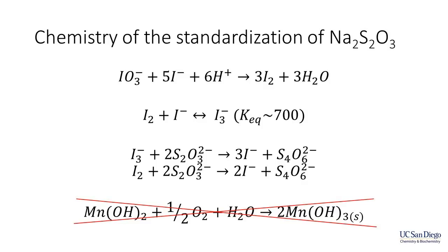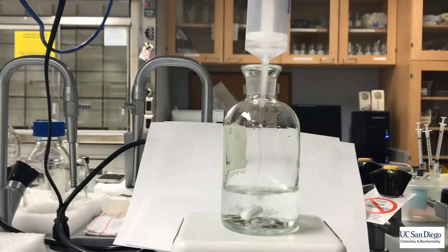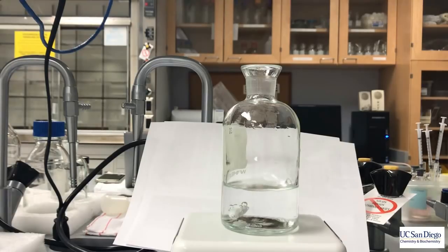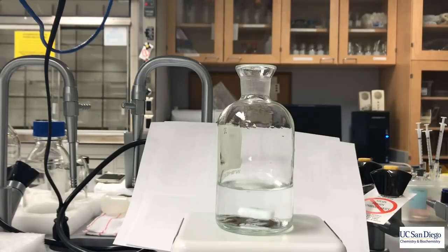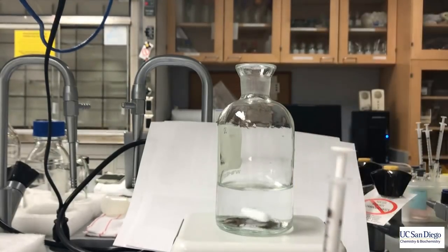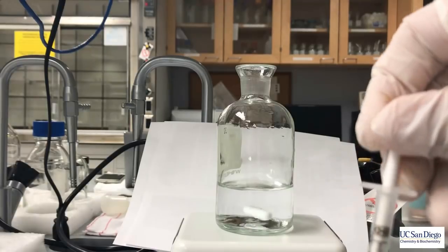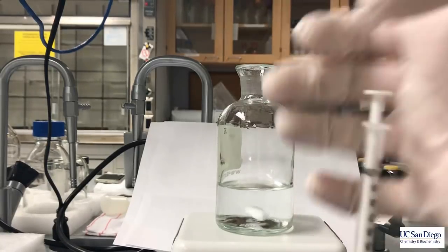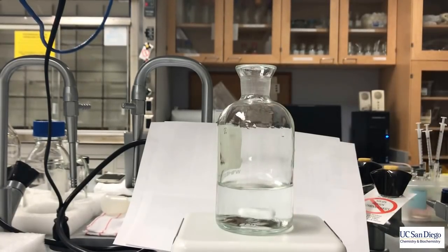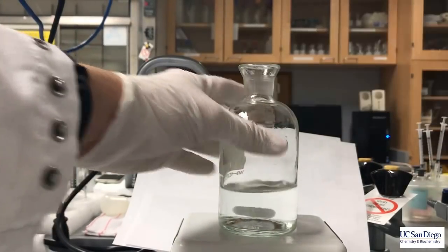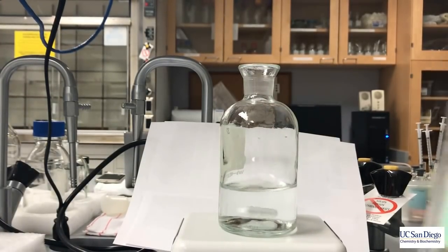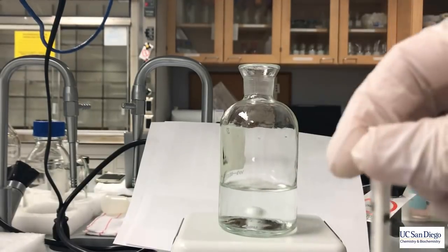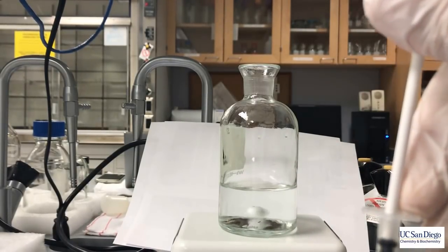This is not what we want because in our subsequent titration, we will have additional contributions from the dissolved oxygen. So let's try this over again. Two additions of the primary standard, and make sure that we are stirring before we add in our acid as well as the base and the sodium iodide. If you have any droplets of acid, be sure to clean them up, as you can forget they are there and end up with acid on your face. Not fun.